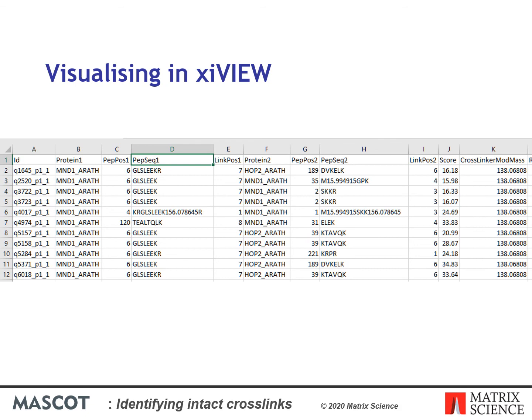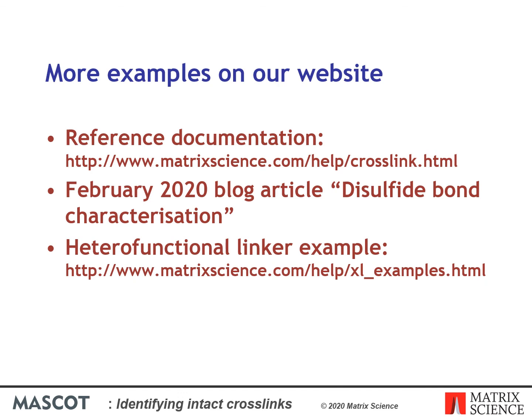xiVIEW can also read crosslink data in MZ-IdentML 1.2 format, which we will support in a future release of Mascot. If you'd like to see more examples of cross-linked searches, we have some on our website.